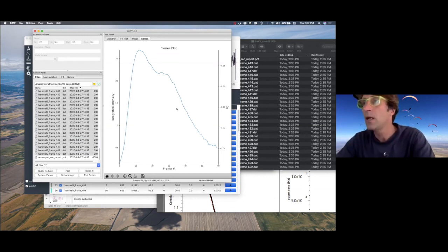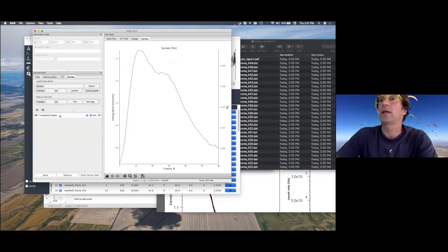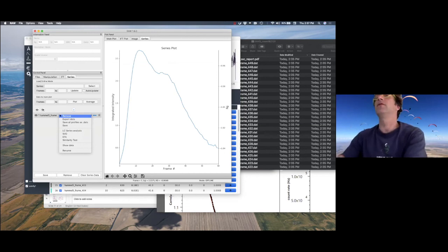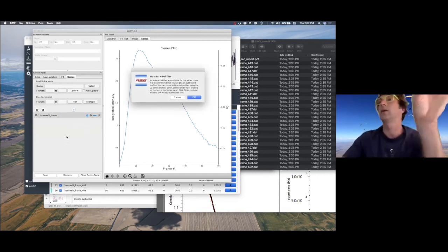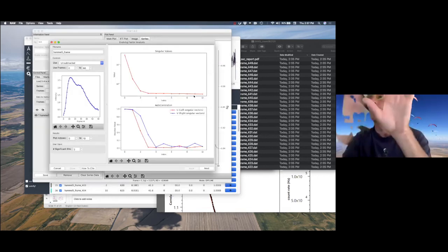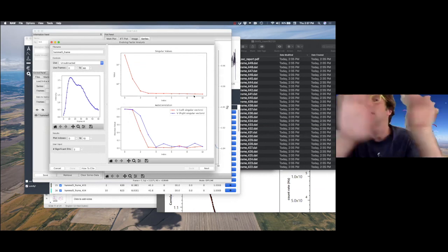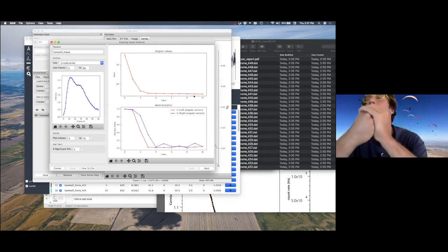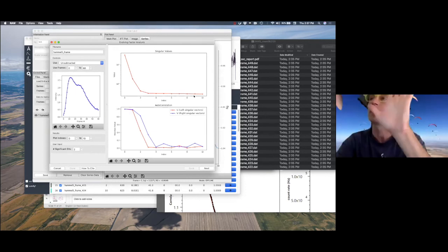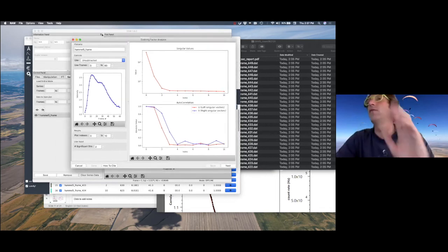In this case, you can go to the series and right click, and it took me at least three days to recognize that. You can go to several types of processing. LC series analysis is exactly what I did in ScÅtter, so I can go straight to the EFA. Luckily, ScÅtter is talking now to RAW, and the file format is very similar, so they can go back and forth without any issues.